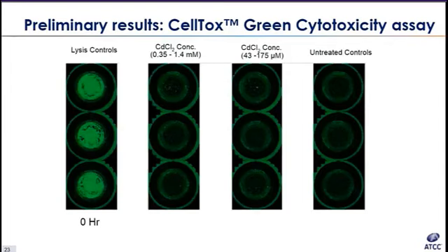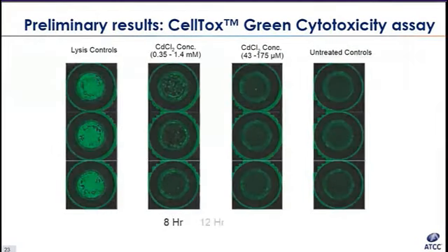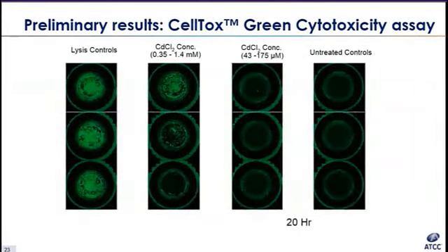These images were taken from plates immediately following cadmium chloride administration and show, with the exception of lysis controls, there is little to no fluorescence or cell death present at 0 hours. However, as time progresses, there is a dose-dependent response to cadmium chloride exposure, with wells exposed to the highest cadmium chloride concentration, shown here in the top left, demonstrating increased cell death following a 24-hour incubation time. These trends are quantified on the next slide.